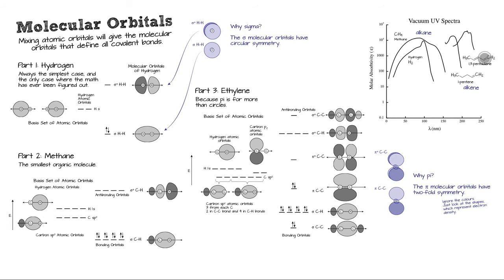Now if I conjugate a double bond, you can imagine that I'm spreading out the electronic system, and of course if things are spread out, they're lower energy. Basically I'll now have 4 pi orbitals instead of 2. That means that they're going to be spaced closer together, and look, we're starting to move higher up into more convenient areas of the UV spectrum to look at. I'm not going to need the cleanest, most special quartz cuvettes anymore. I can just use the regular cuvettes that don't clean so much.